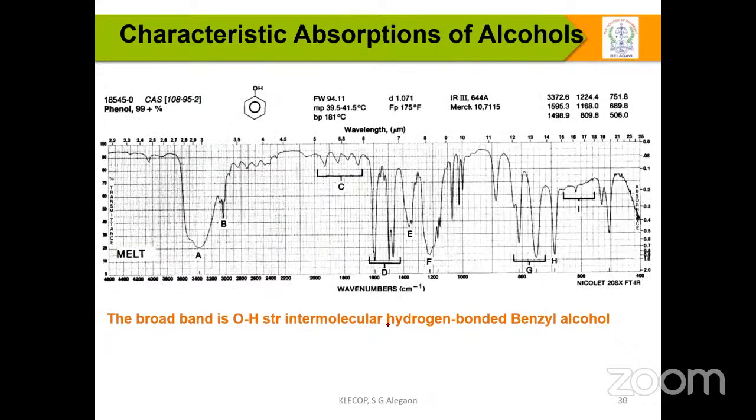Okay, look at this. If you take simple phenol, I'm going to get a slightly broader peak. From organic chemistry, phenols act as acidic in nature. According to some of the literature, acids more or less give a very broad peak because of the acidic OH.